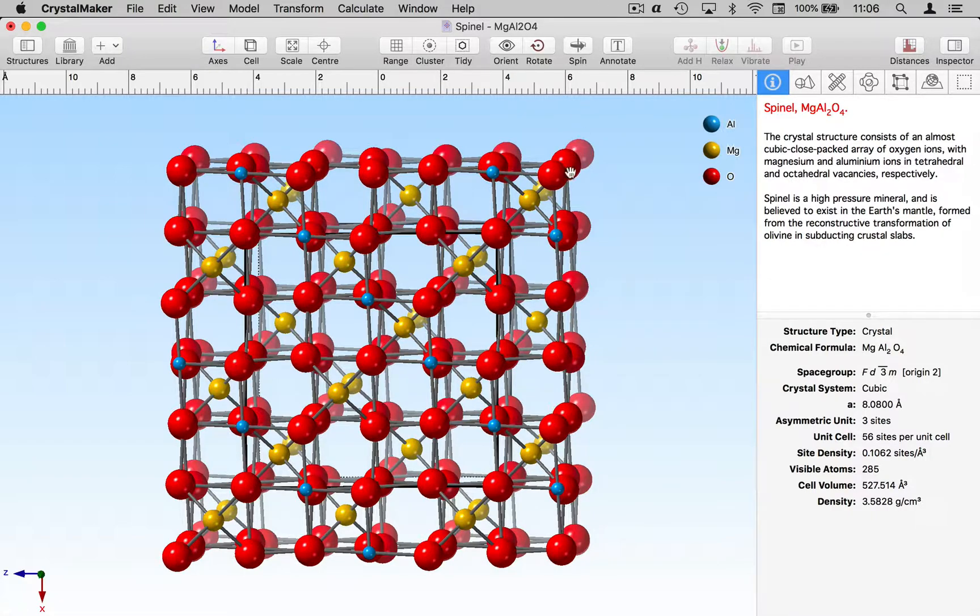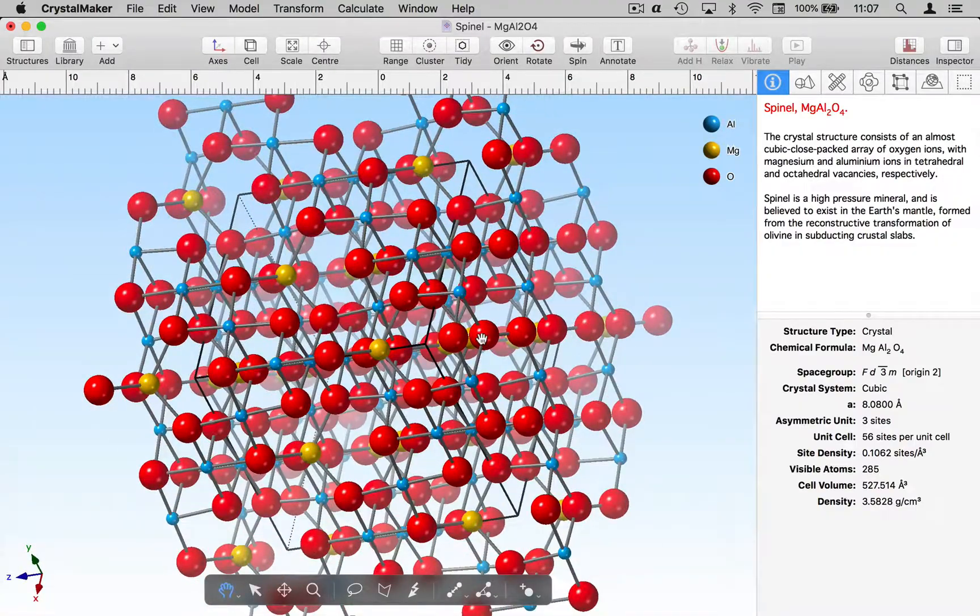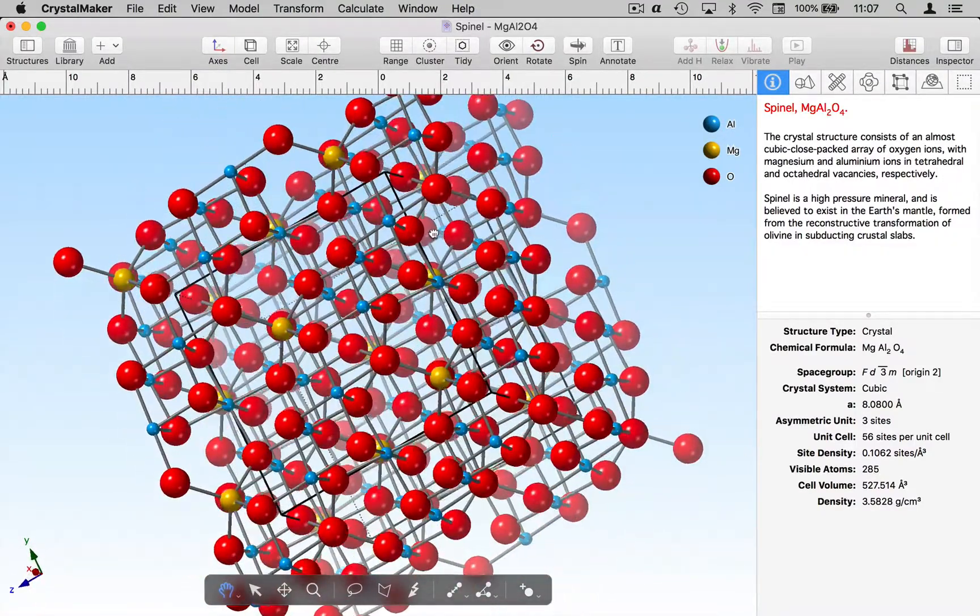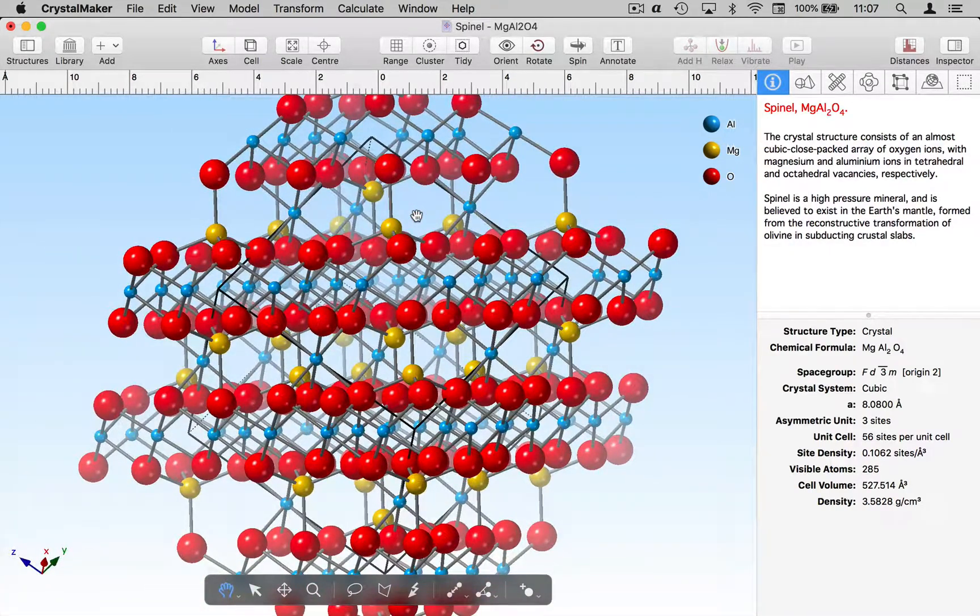So here I'm starting off with one unit cell of the spinel structure, and in this particular structure we have quasi close-packed layers of oxygen and I want to try and insert a molecule onto one of these layers.